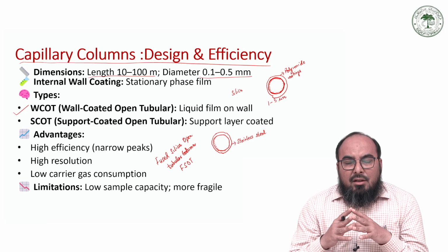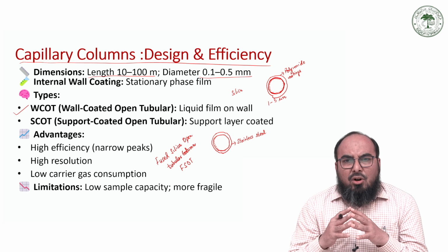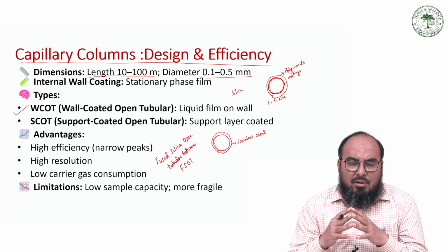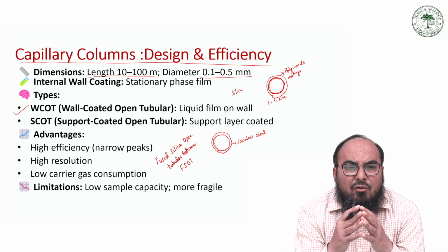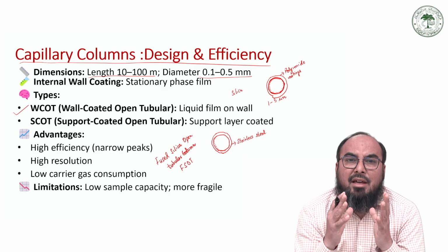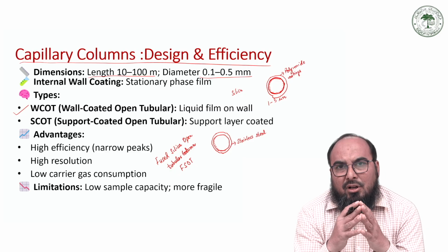Now here the silica, which is actually a very high quality glass, is taken for making columns, and these columns are highly efficient columns and they give you very good resolution. And the beauty of this is that because these are hollow in nature, they give very less resistance to the flow of the carrier gas. So that is the beauty of using these capillary columns.